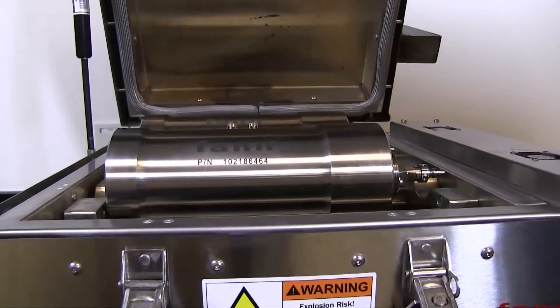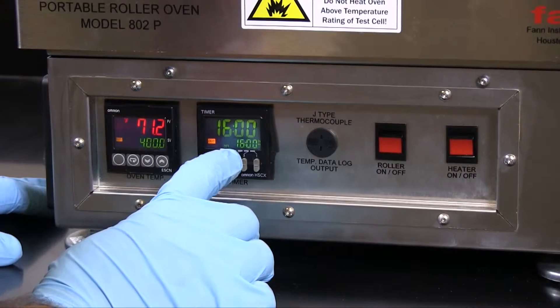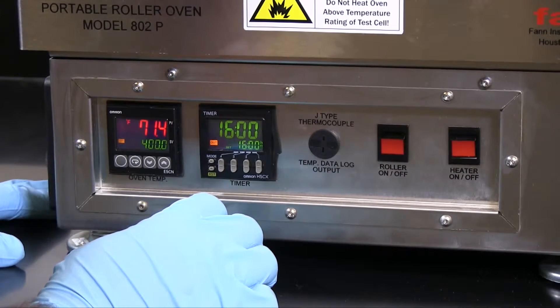The 802P roller oven holds two cells and allows the logging of temperature data with a Type-J thermocouple logger. The timer can be programmed to delay the start of heating and shut off at a designated time.